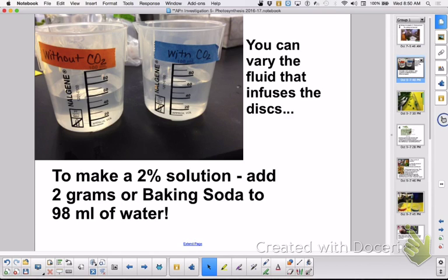I put in some lab tape in here, and you can write on the lab tape with a Sharpie. You have a Sharpie in your pencil bucket of fun, and you put 2 labels on like I did, whatever your 2 solutions you decide to be. Oh, and you should clean them out in case they're dirty. Because whatever that is, could throw off your lab, right? So make sure they're clean and get rid of any kind of residual soap that's in here.